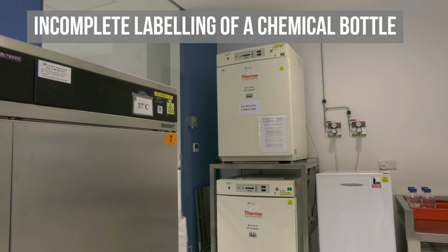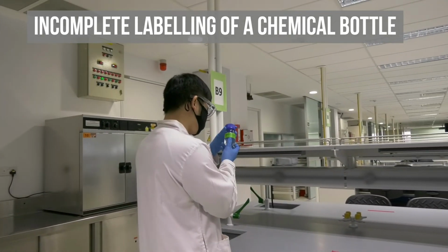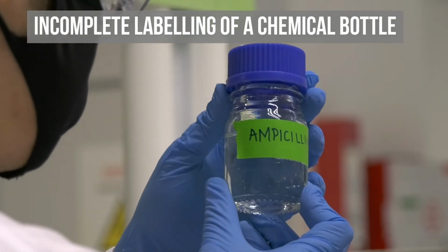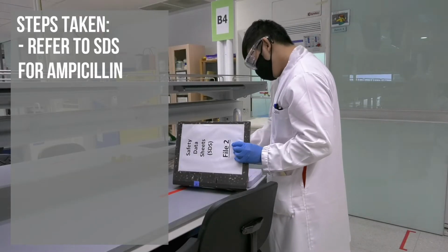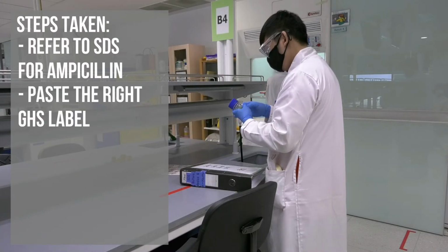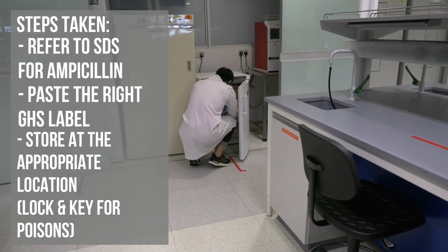Now, let's watch a scene where ALT chances upon an improperly labeled chemical. He notices a bottle labeled ampicillin without the GHS labels. He referred to the SDS for ampicillin and pasted the bottle with the right GHS label. He stored the properly labeled bottle in the freezer.